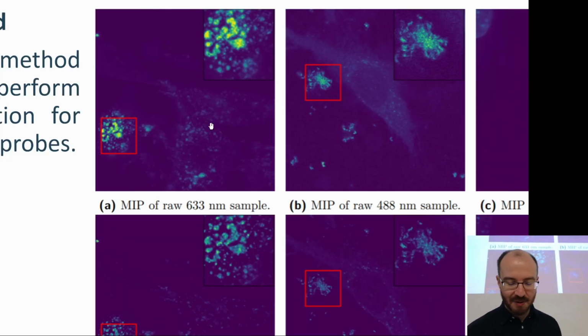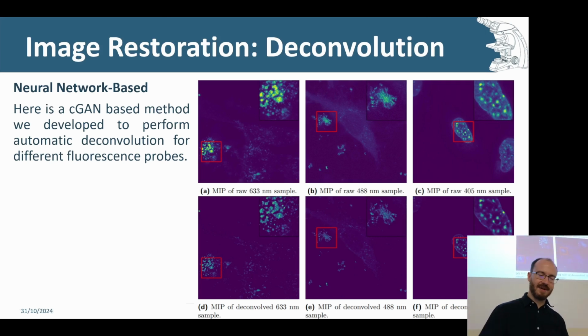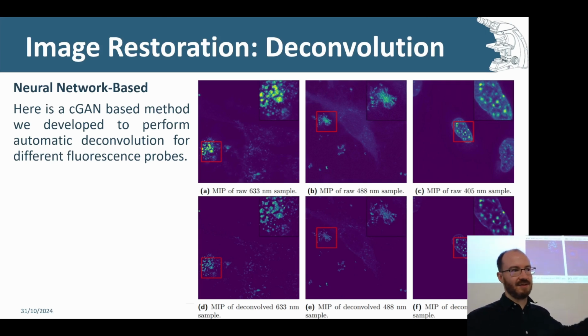Maybe as we're talking about this, it is also good to recognize that deconvolution does change the intensities, and quite dramatically. Let's say you start with a 12-bit image where the intensities are between 0 and 2000, for example. After deconvolution, the intensities could vary between 1 and 10,000 sometimes. It's a very crude operation for intensity values, but the relative intensities are reliable. It's just the actual intensity that becomes quite different.